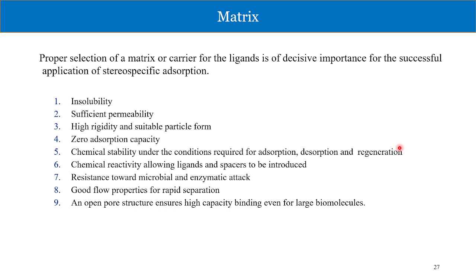Then it should be chemically stable under the adsorption desorption process. Chemical reactivity should allow the ligands and the spacers to be introduced for the proper affinity to your protein of interest. Resistance to microbial or enzymatic attacks, otherwise it would hamper the entire column. Your column gets destroyed. Good flow properties for the rapid separation. The mobility should be fine enough.